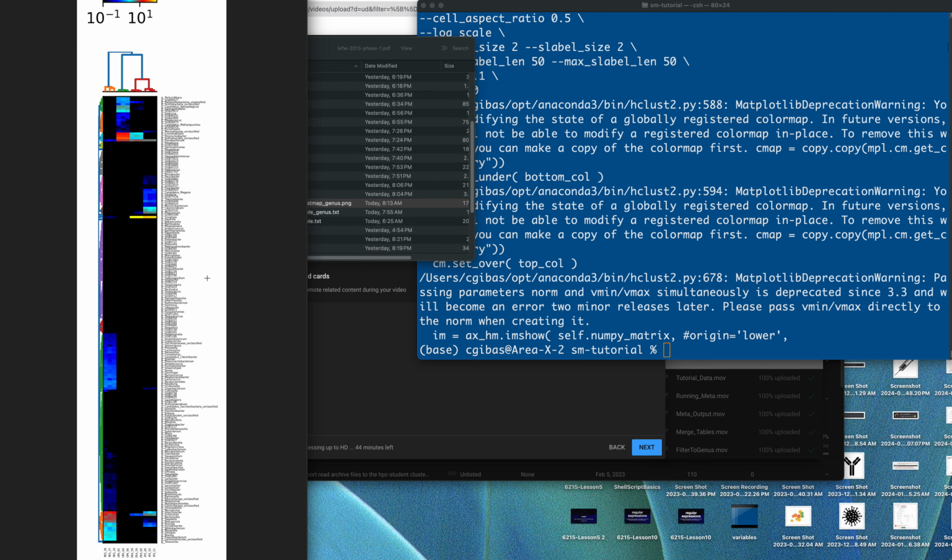Now the size of the classification names is manageable. They're not overlapping each other. You can see what's there, but this is really a big heat map. What you might end up doing is filtering down, so that if you have only 0 values on a row in your data table, you might just exclude them, or exclude them if they were only present in a very small number of reads, which is a little more complex to do.